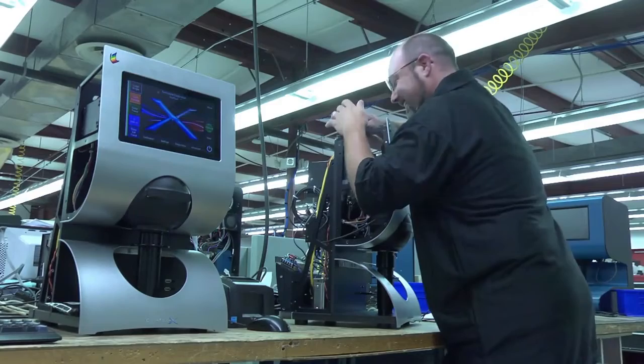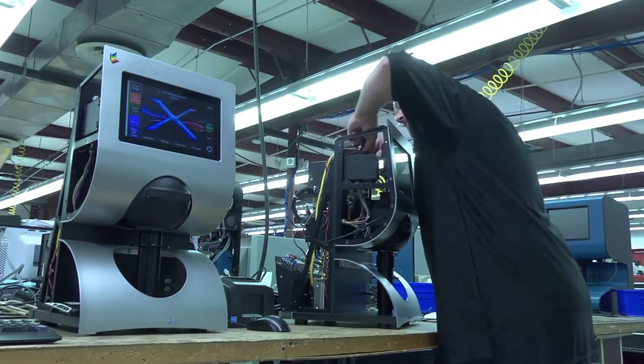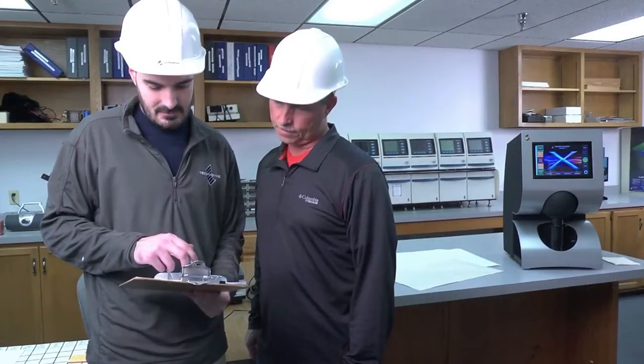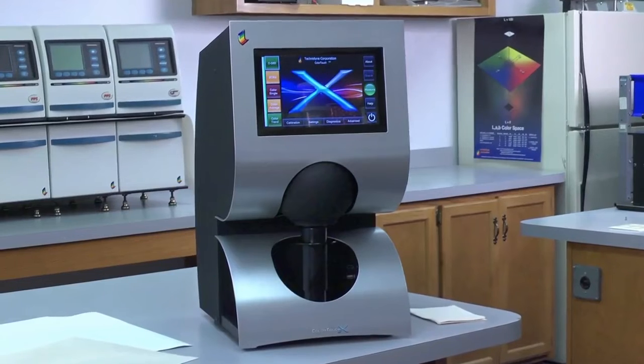And as always, Technodyne's technical expertise is available to provide support whenever and wherever it's needed. No other instrument in the market today can match the Color Touch X for capabilities, functionality, and quality.